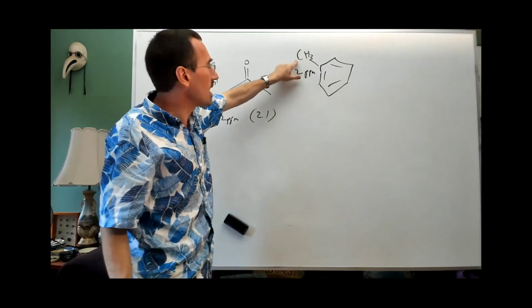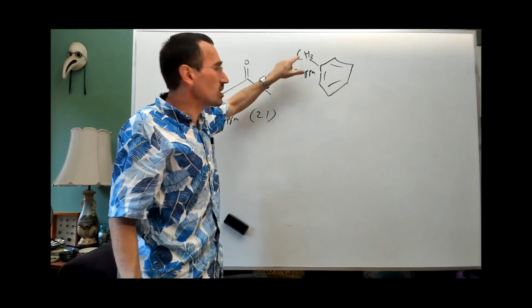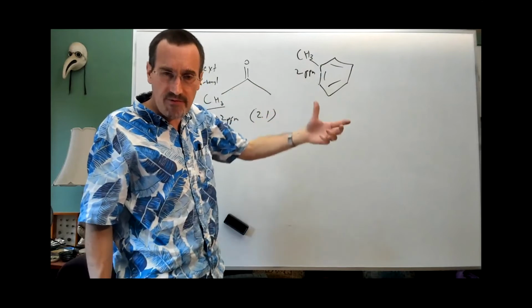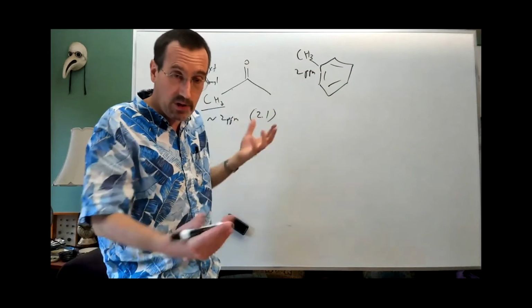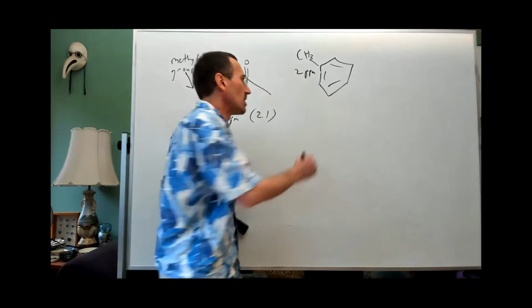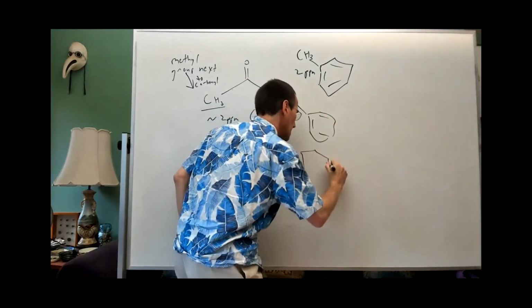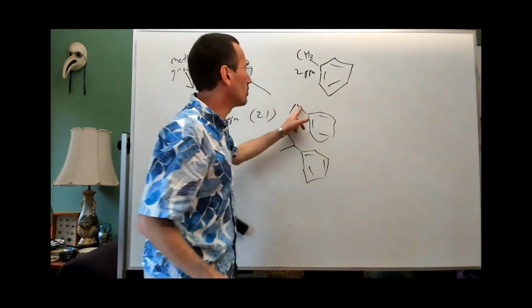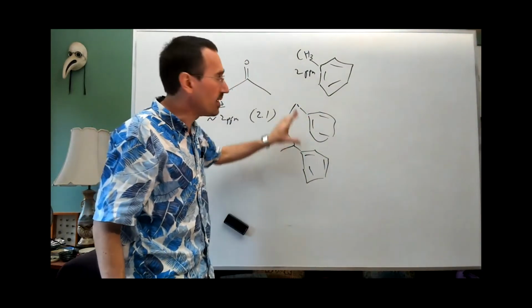And again, I come down to the fact that having that relationship of 0.4 ppm to bring us to a methylene, and 0.5 of a ppm more, so 0.9 or 1 more, allows us to bootstrap ourselves so that we could immediately go ahead and say, okay, here's ethyl benzene or here's isopropyl benzene at somewhere around 2.5 or 2.4 and somewhere around 3 parts per million.